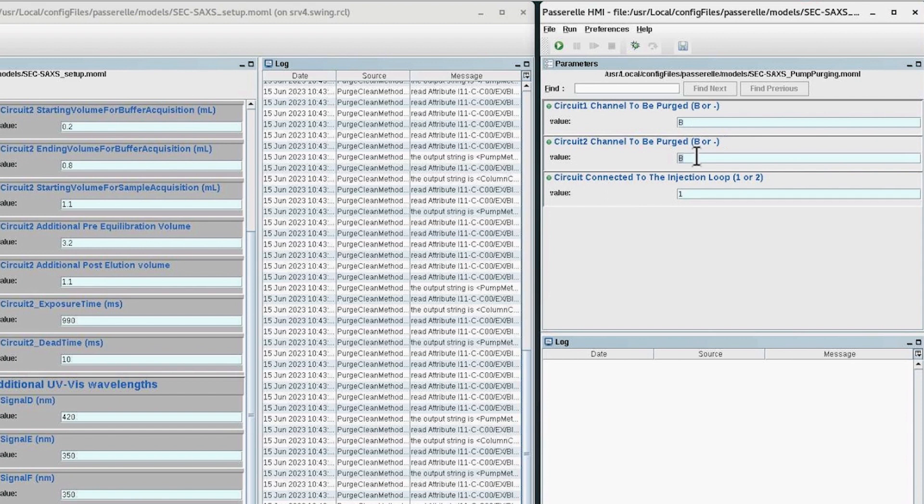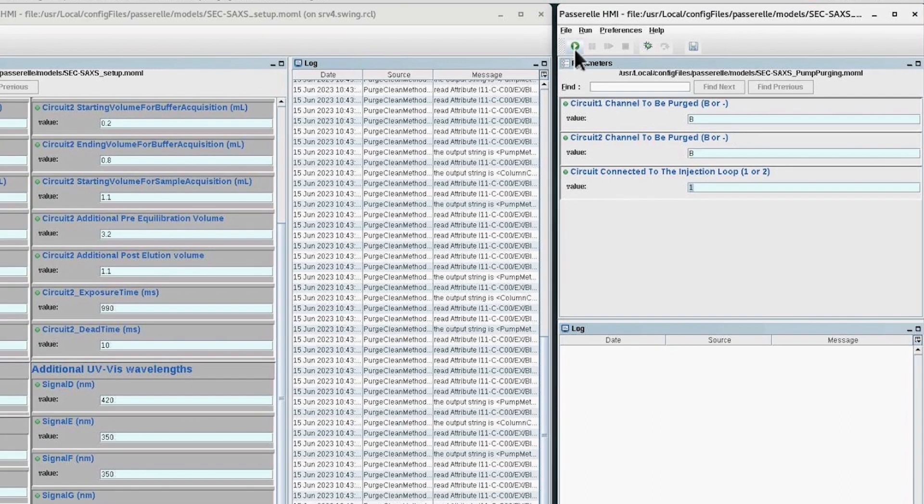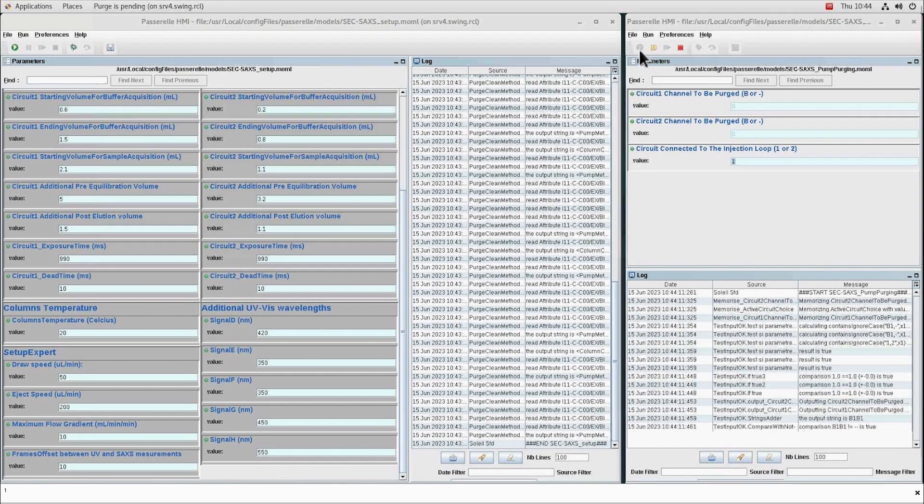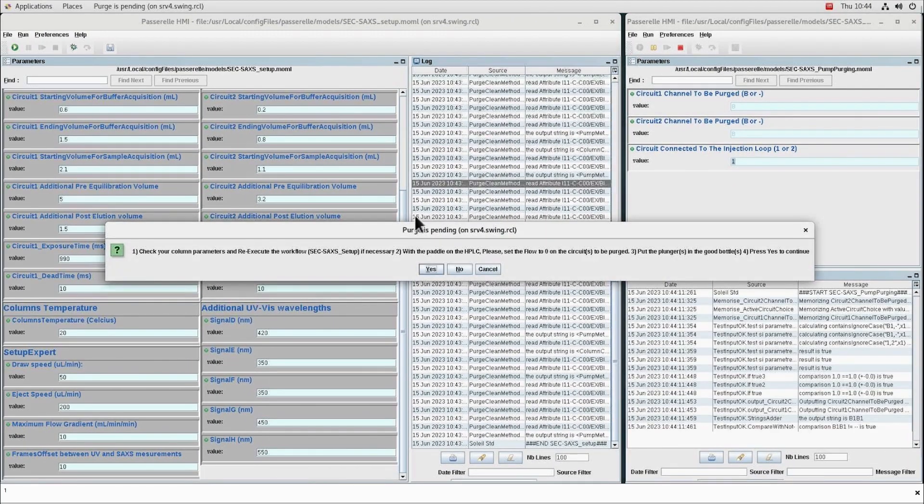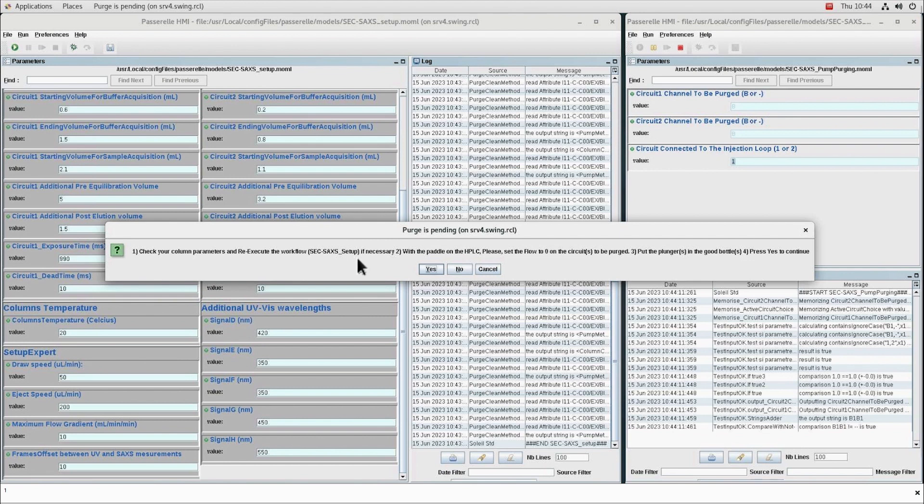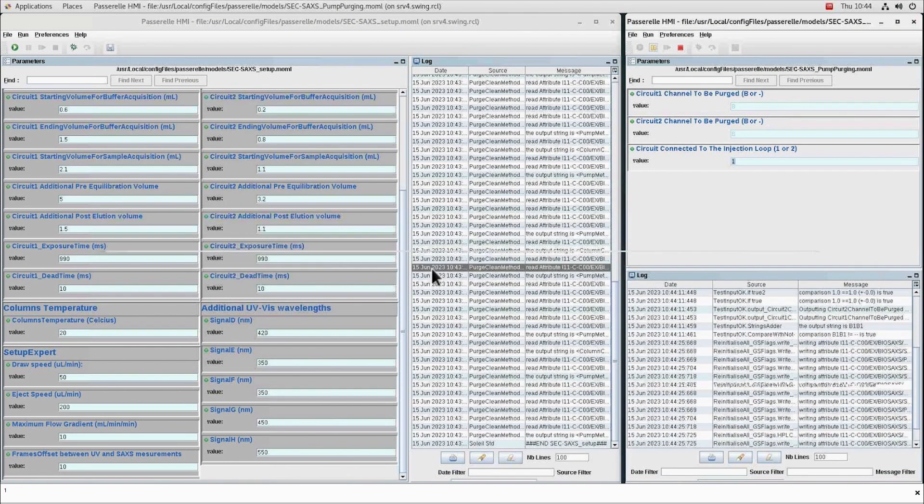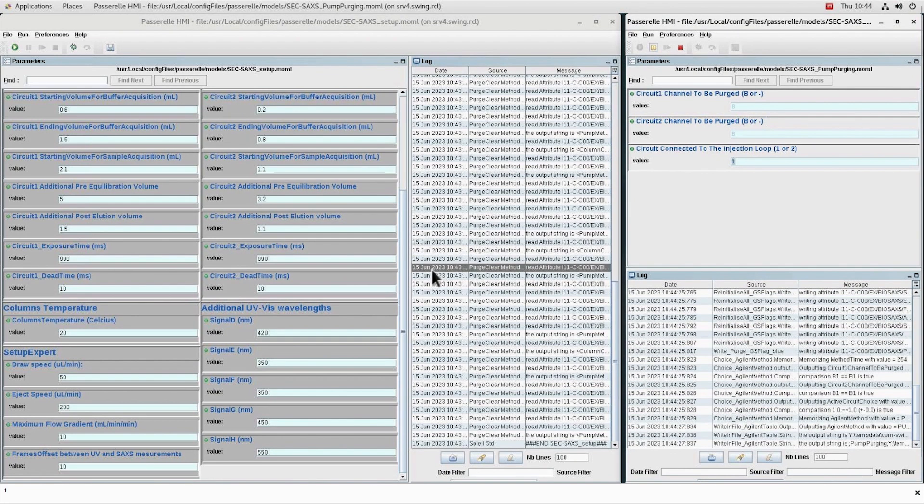Then you have to select the active circuit to rinse the injection loop with the buffer with which you want to perform the next injection. To execute the workflow, press the green triangle button. A pop-up window appears to remind you to check the column parameters. If everything is correct, press yes.